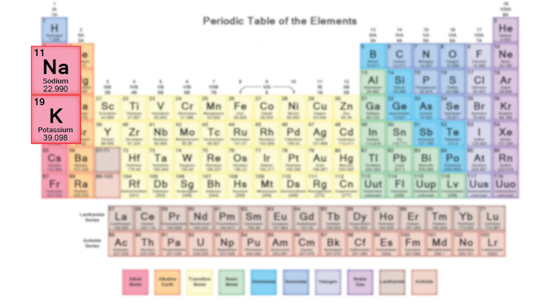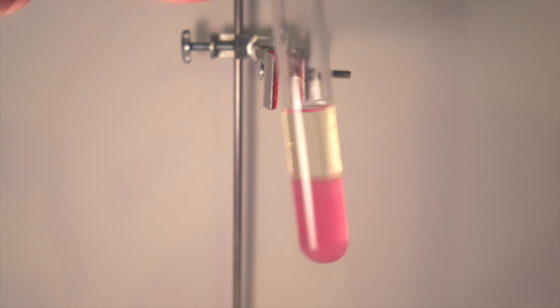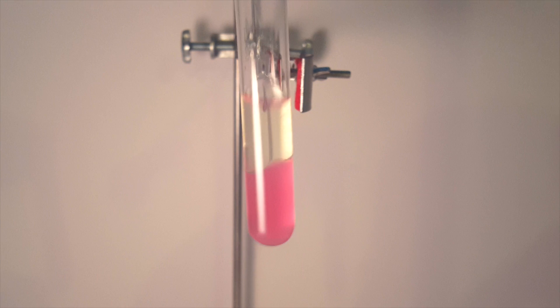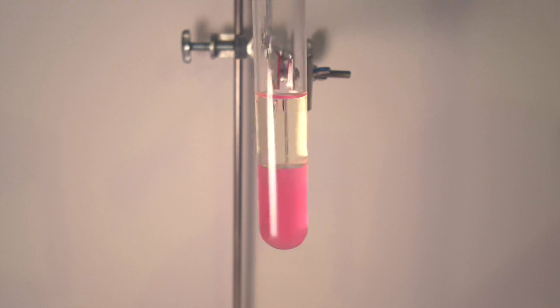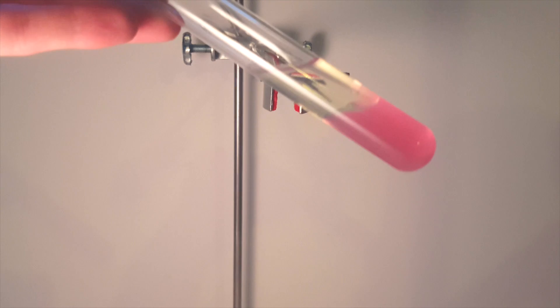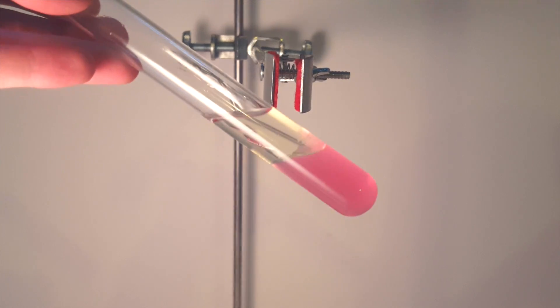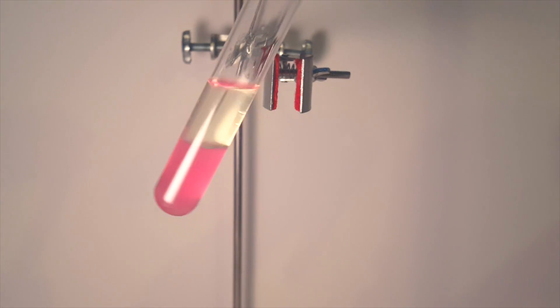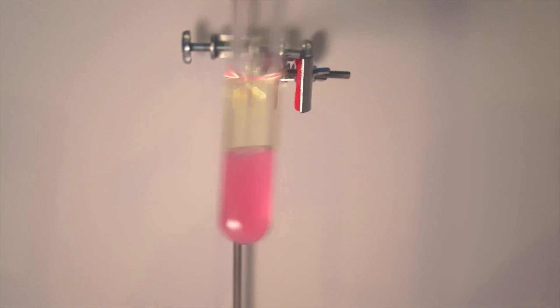Both are alkali metals located in group one of the periodic table and react violently with water. So to set up this experiment I had to use water and a solvent that would not react with sodium or potassium. However, it needed to be less dense than both water and the metals. So I used gasoline as it was the most readily available for me.